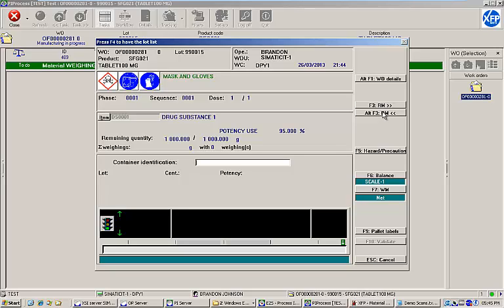Beneath that, we have information on the material to be weighed. Our item's ID is DS0001, and its description is Drug Substance 1. We are instructed to weigh 1,000 grams from a lot with a potency of 95%. Finally, there is a container identification field where we can scan the container ID of our source container and begin weighing.